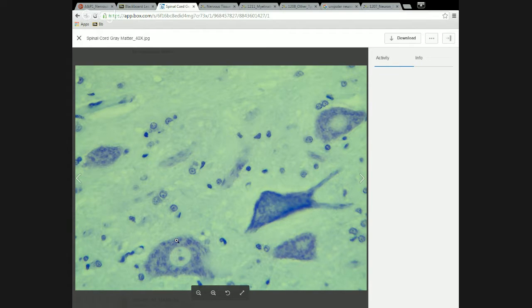The DNA, because of how Nissl staining works, doesn't stain very darkly because there are things offsetting its particular negative charge. But the RNA that makes up the ribosomes picks up a lot of stain because it's actually very negatively charged. And the point of this procedure called the Nissl stain is to highlight ribosomal RNA.